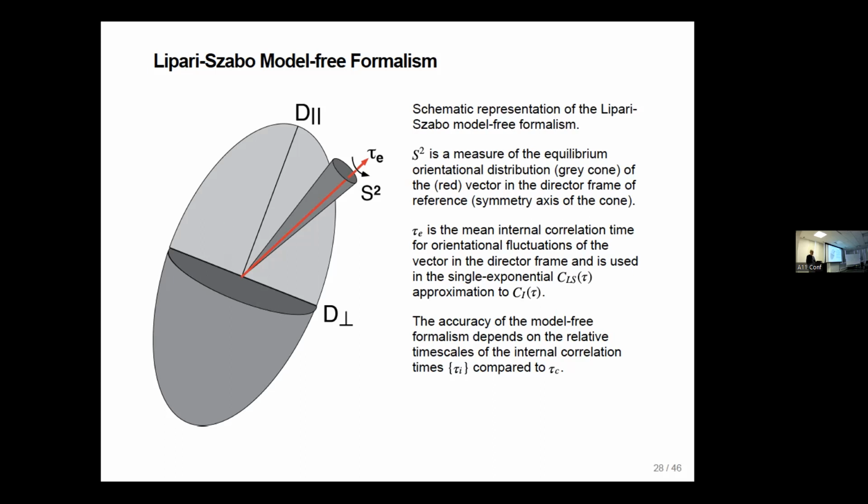That said, at high field, certainly for NH at 500 megahertz, you're already in kind of a high field limit. We think, again, from work that Michelle Gill did when she was a postdoc, that agrees very well with similar work at the same time from Martin Blackledge and Fabien Ferrage, that the nitrogen-15 relaxation data contains about 5 bits of information.